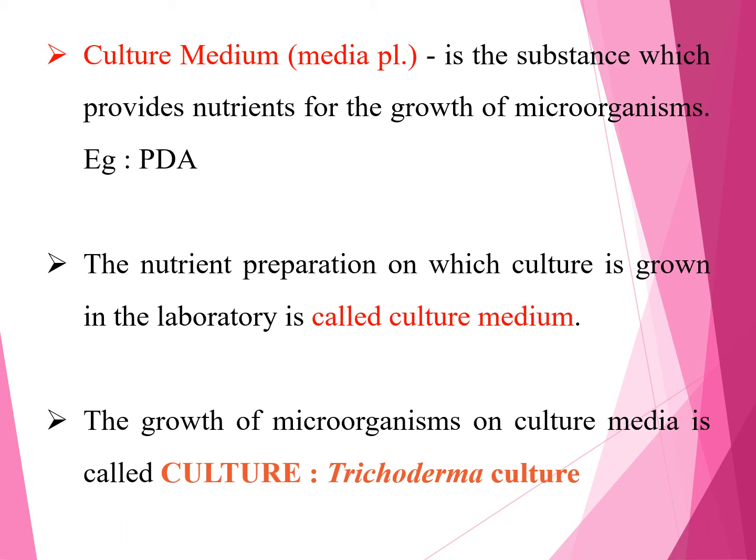Here we also should know what culture media is. A culture media is the substance which provides nutrients for the growth of microorganisms. For example, potato dextrose agar is used for growth of fungal microorganisms.